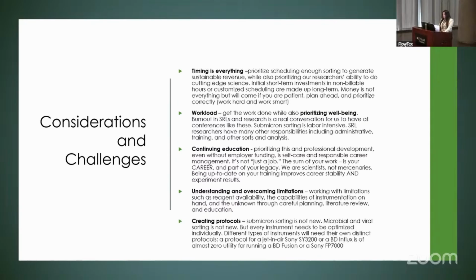Everything about SRL research and submicron work is interdisciplinary. So it's how we took the time to do the R&D in spite of the fee-for-service funding situation that all SRLs have to deal with. We researched the landscape of the market for sorters and reagents. We accounted for theory from various fields to produce usable results, and then collaborated meaningfully with investigators to gain insights into the effectiveness of the procedures and then produce cutting-edge results.